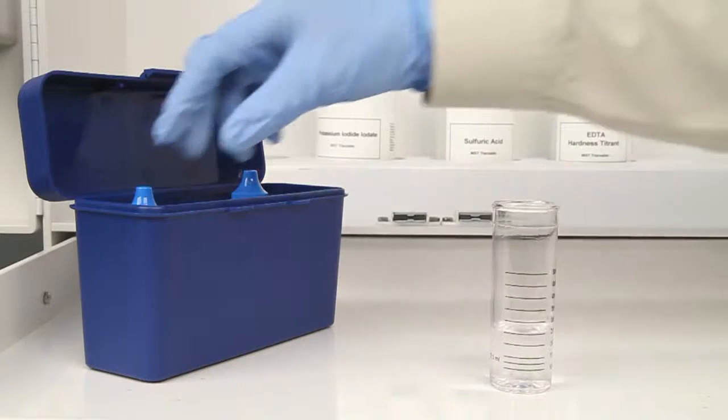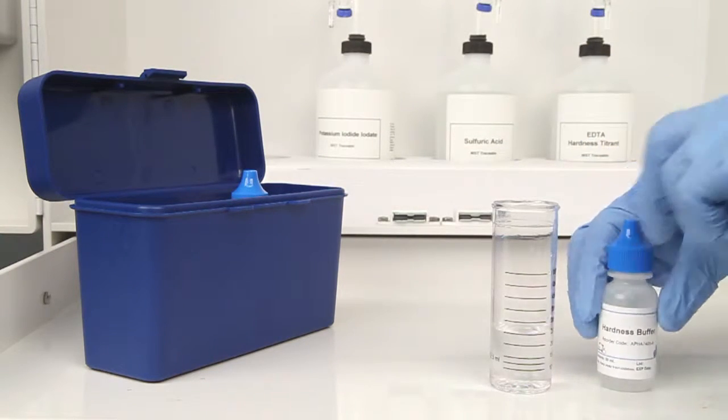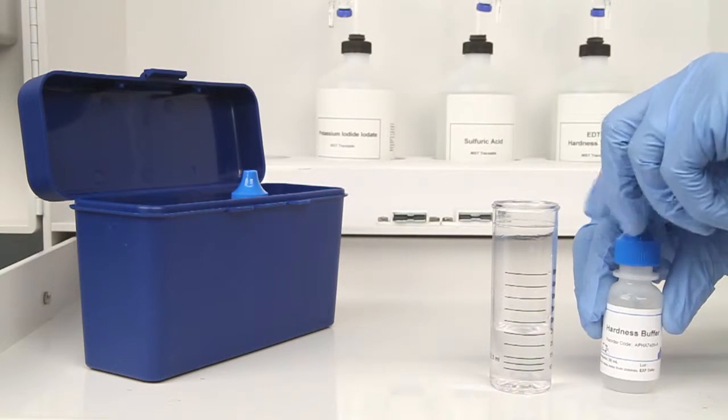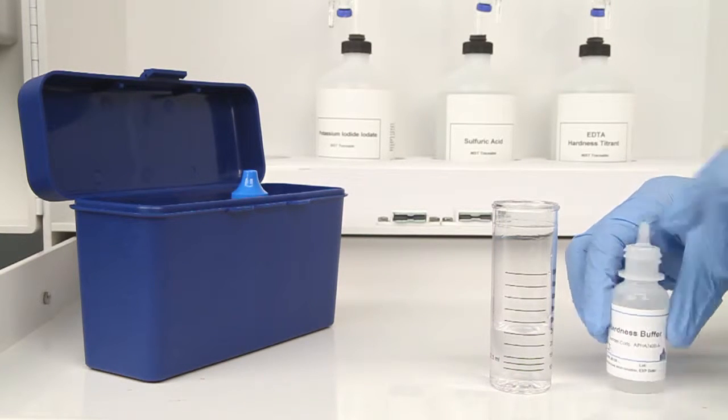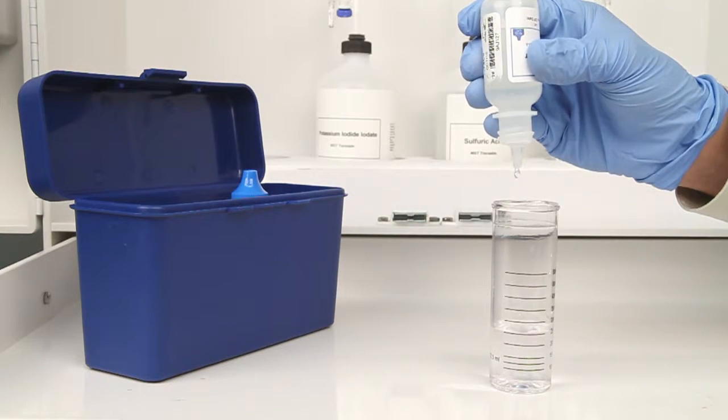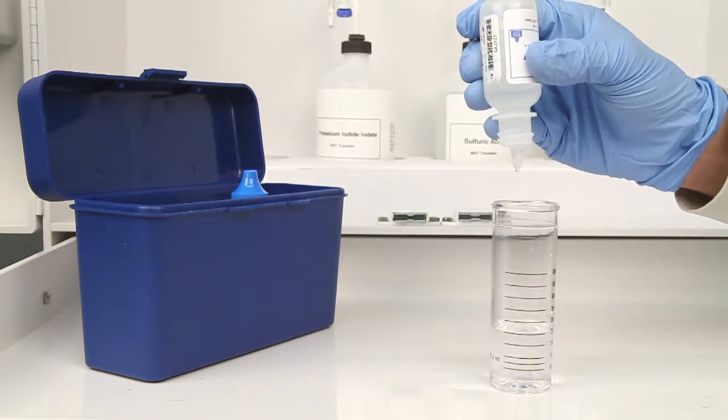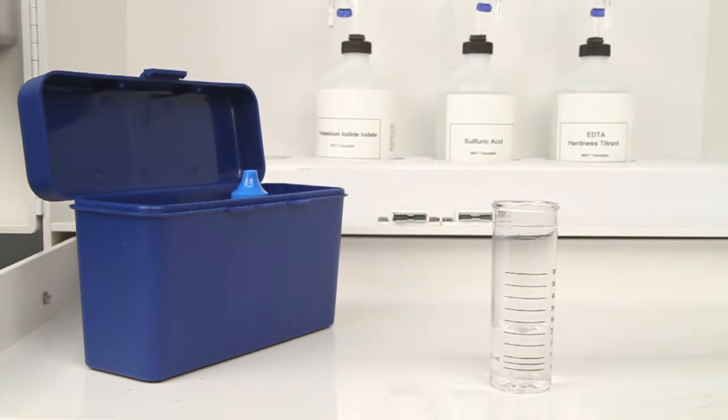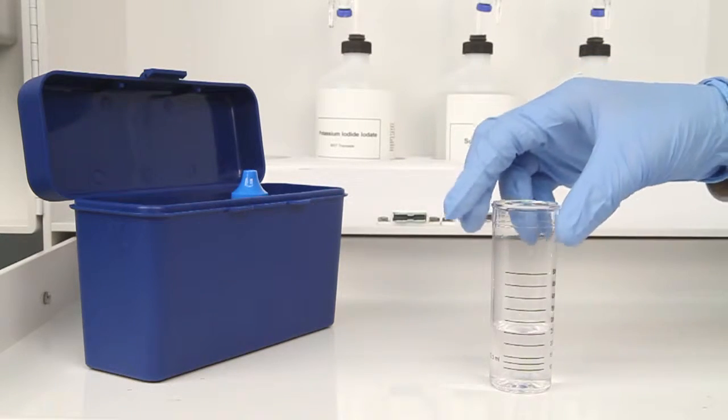The next step is to add five drops of hardness buffer. The bottle contains a dropper tip, so it's important to hold the bottle vertically to get a consistent drop size. After the addition of each reagent, swirl the vial to ensure the reagents are properly mixed.